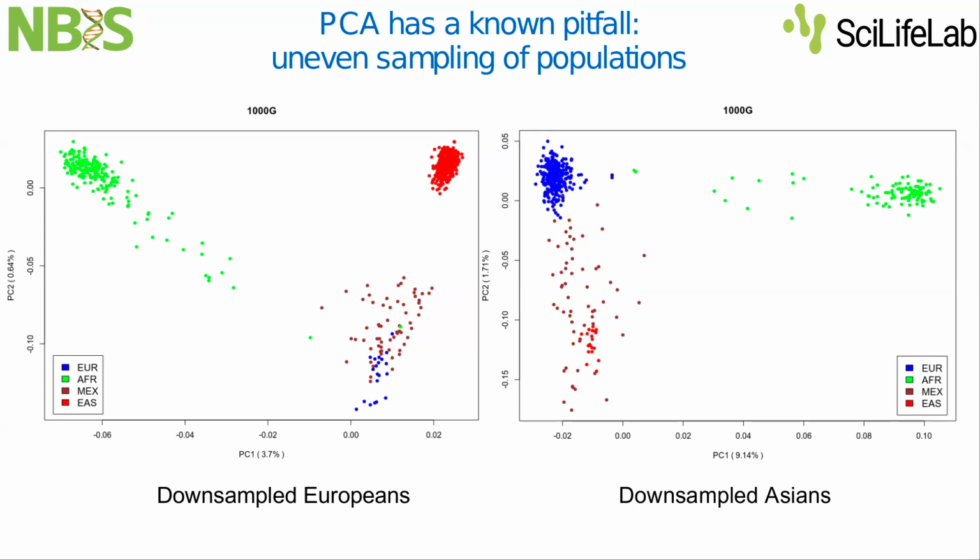When we get a tissue, for example, some cells tend to be more represented in that tissue, and we still want to use PCA. Is it viable to subsample all of the different cell types that we have identified to a specific number, create a PCA with that, and then reintroduce the other cells that we've removed for the PCA for downstream analysis?